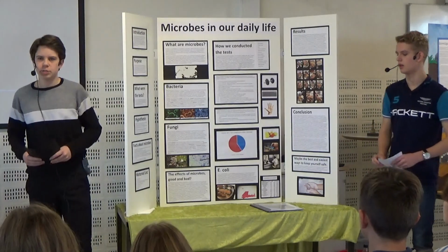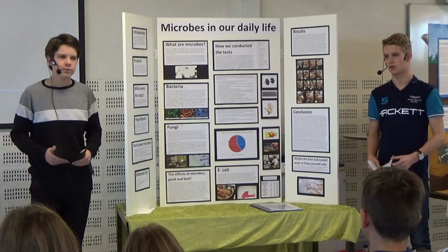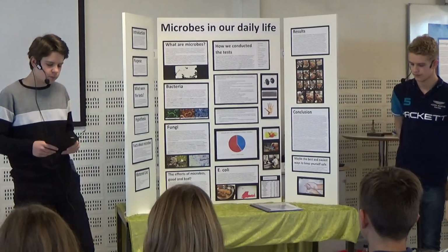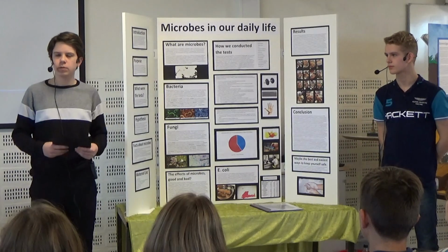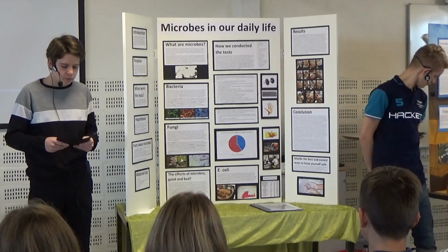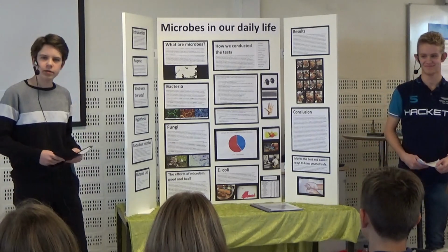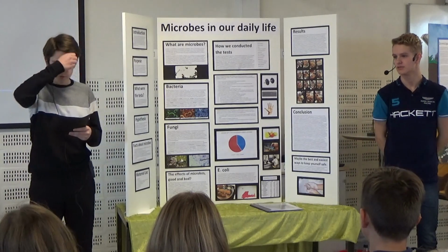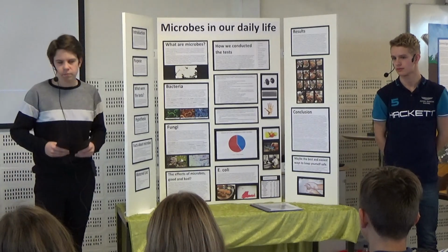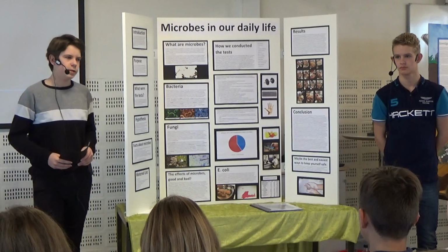If you have ever been to the gym, you should know that you always have to clean the machines with ethanol after use. One of the things we wanted to test was if the cleaning actually works, and we will conclude that it actually does. We made 3 tests of different equipment in the gym: 1 machine, 1 treadmill, and 1 free weight. The result of the machine was good and showed that the small area we did the sample on was very clean.